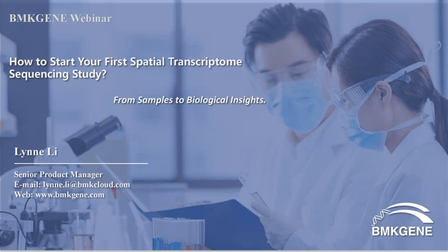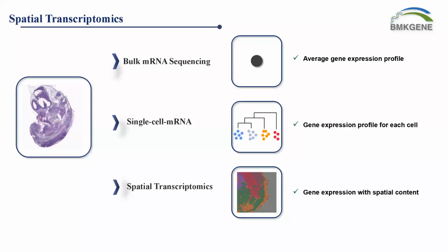So before we go into the details of spatial transcriptomics, I would like to have a very brief recall on the typical mRNA study technology, which is NGS-based mRNA sequencing. It has been widely applied in most biomolecular level studies. In this most typical technology, if we think of the way that we prepare the samples, we have one sample in the tube, and whatever is in this tube will be lysed in the lysis buffer, and we take the total RNA from there.